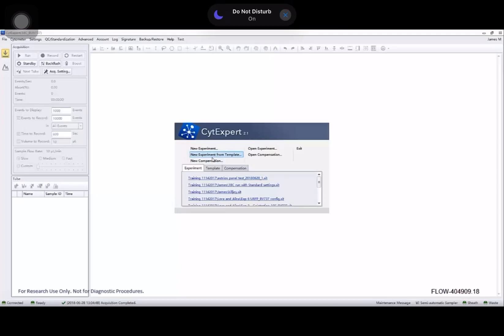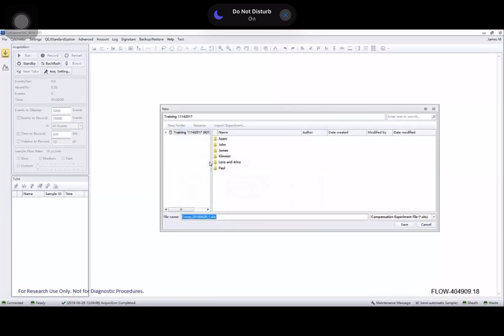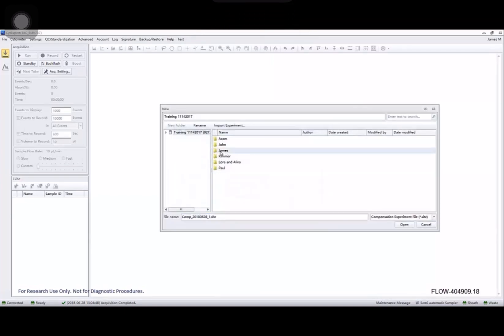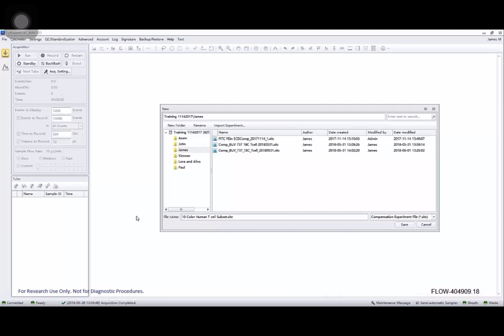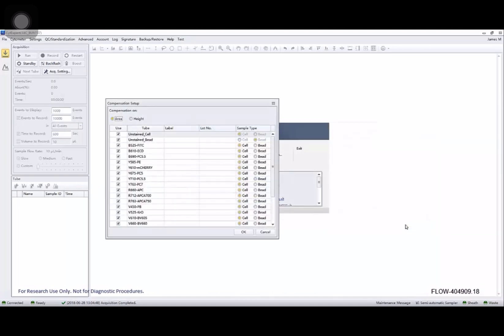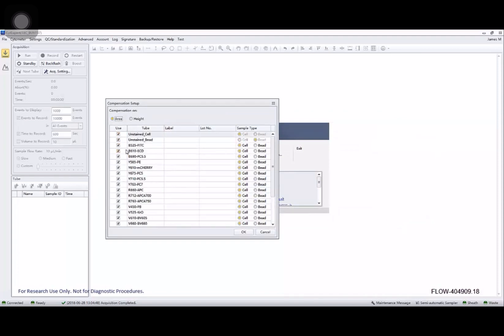Let's look at how we create a compensation experiment in CytoExpert. Click on new compensation. I'm in electronic record management mode here so I have some folders to work with and I'm just going to name this example 10 color human T cell subset and I will save that experiment.